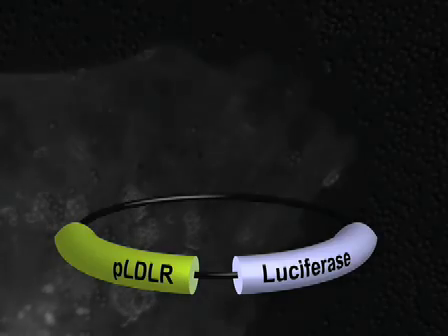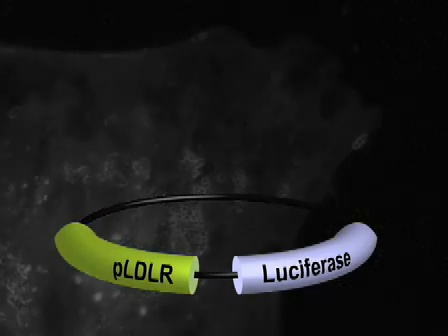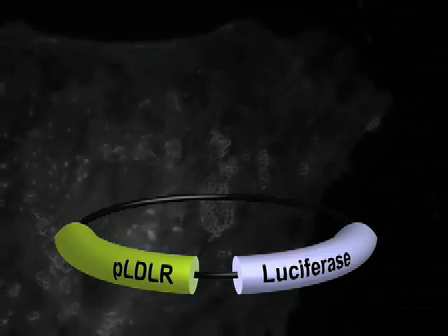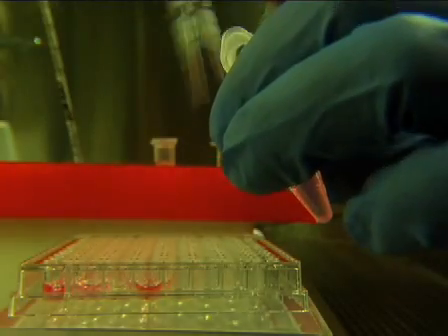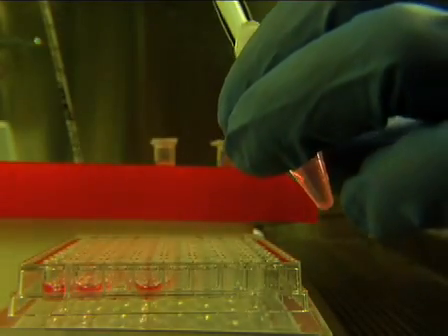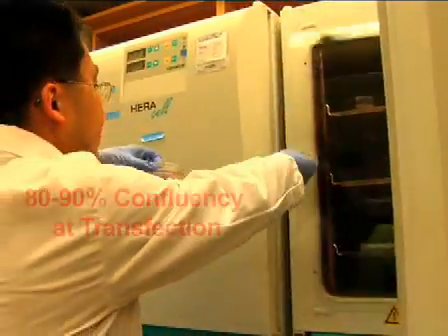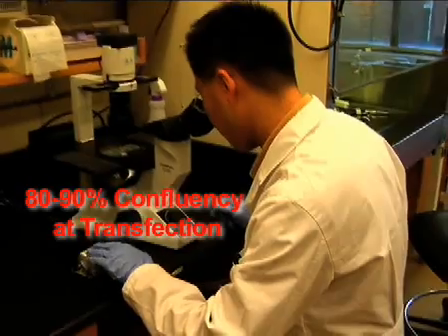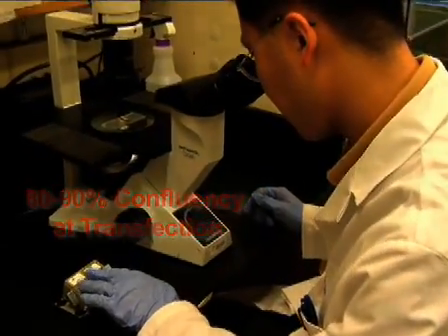We have just shown you how to use a luciferase-based reporter gene assay to measure expression from the LDL receptor promoter in response to phagocytosis of latex beads. When doing this procedure, it's important to remember to be sure that the cells are only 80 to 90% confluent at the time of transfection.